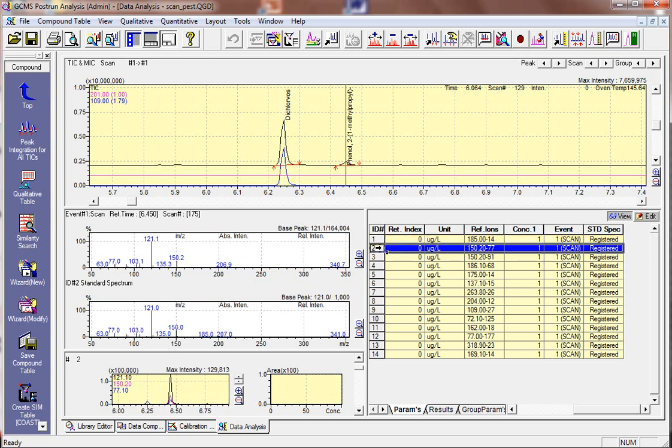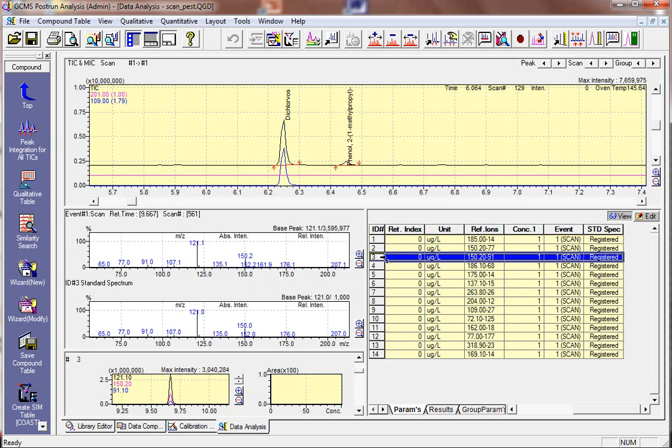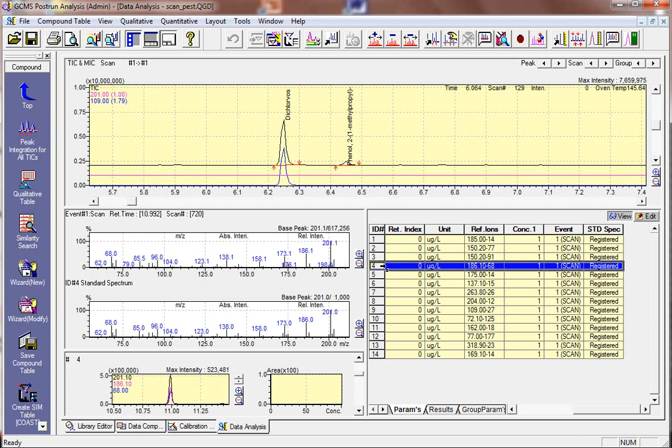And of course it's very close to the one we see on top, measured, because this chromatogram has very neat peaks and there is no difference. But when there is a lot of matrix, this measured spectrum might be different, but it's helpful to see the standard spectrum as well.